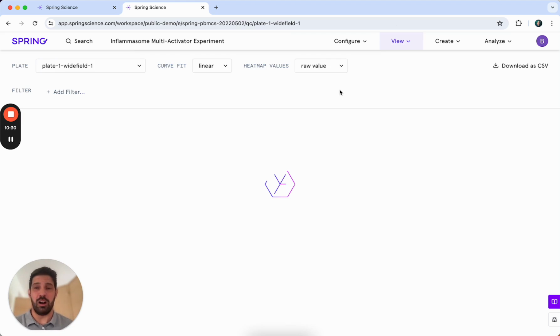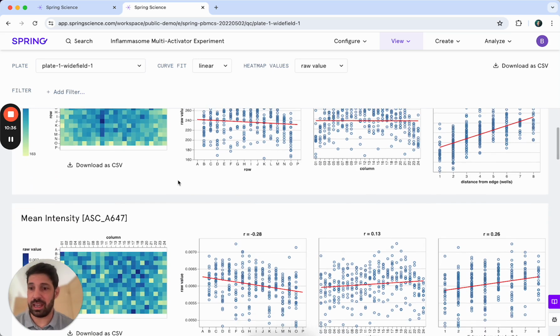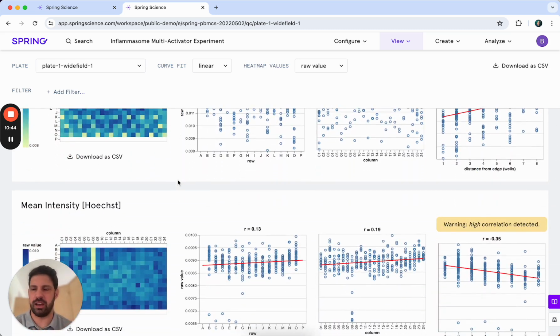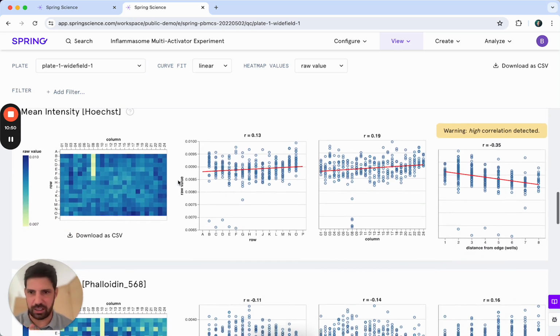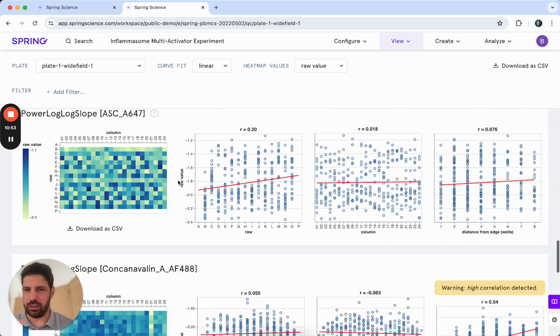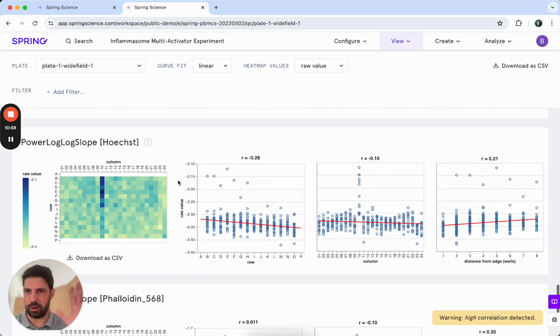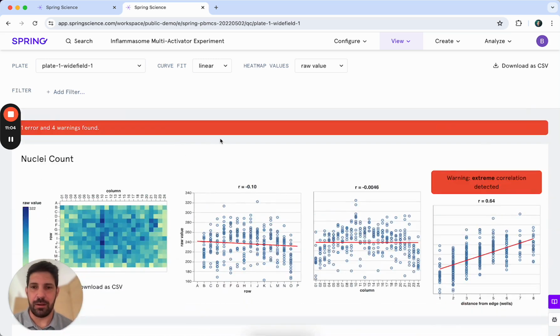At the same time, we do automated quality control analysis as soon as data gets uploaded. We've been generating imaging data and analyzing it with AI tools for 7+ years now, and so we've built quite a lot of techniques to establish whether data is AI ready or not, trying to knock out various experimental biases. We do row by row, column by column, edge effect searches, looking for any sort of disturbance or bias that may have come up in your batches, your different imagers that ran, things like that. And we've worked with all the imagers that are out there and many different protocol and experimental setups in order to build quality control systems and make sure that you are ready for AI analysis. So that's table stakes.